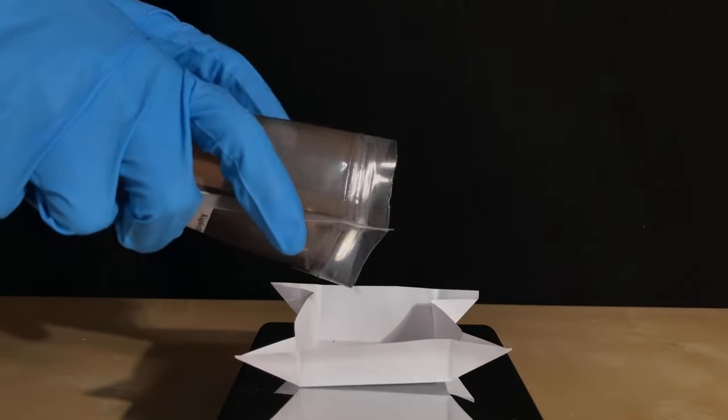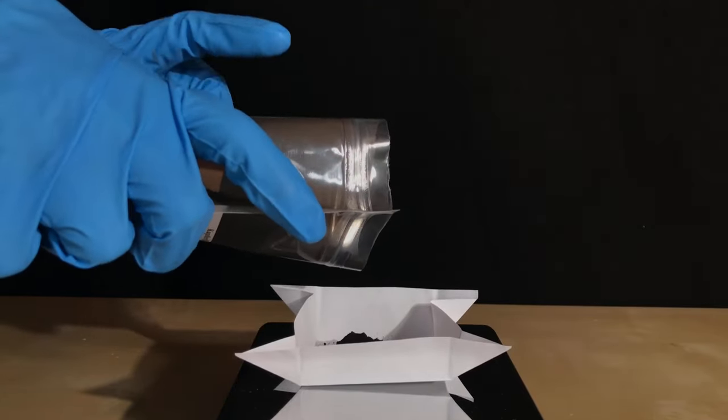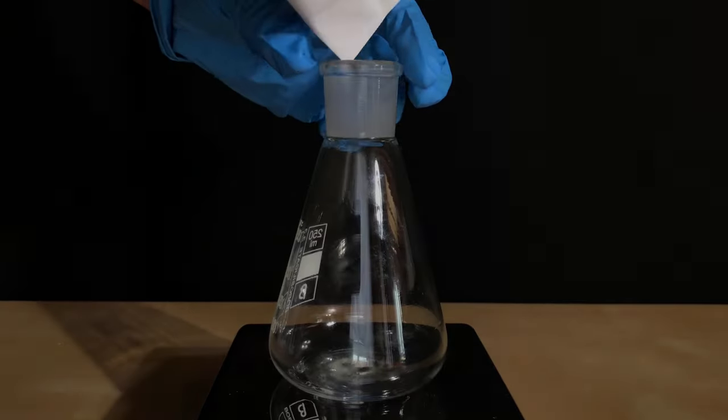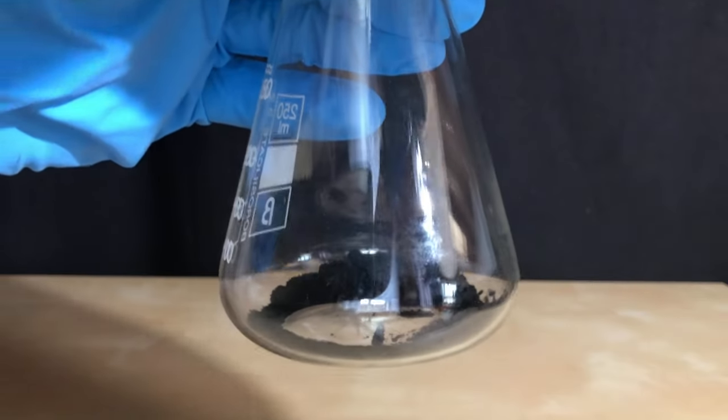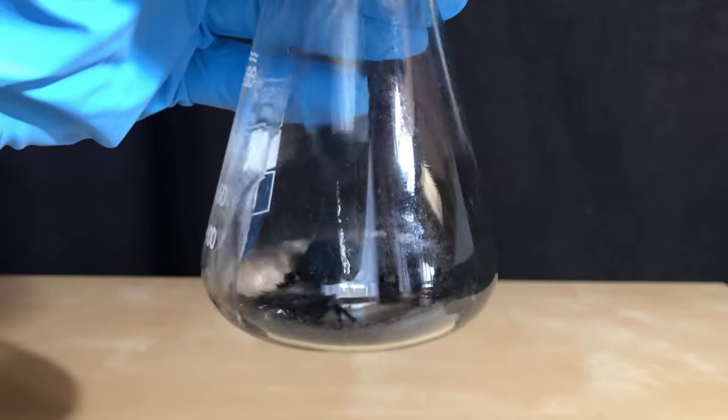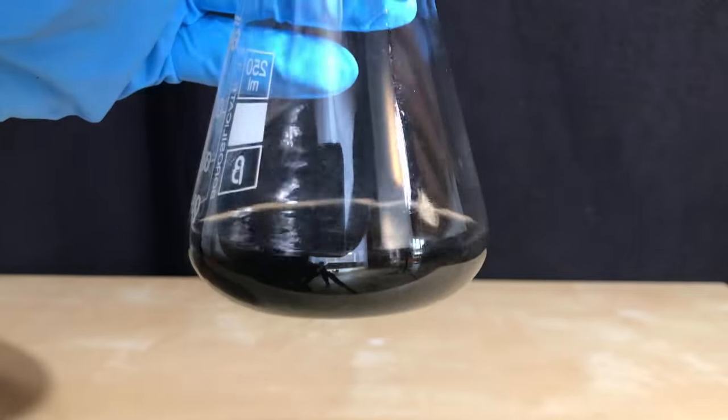The copper 2 oxide, which is a black powder, was weighed out next. 8 grams of this chemical were used. The copper oxide was added to a 250 milliliter Erlenmeyer flask. If I repeated this preparation, I would use a 500 milliliter one. About 15 milliliters of distilled water were added.